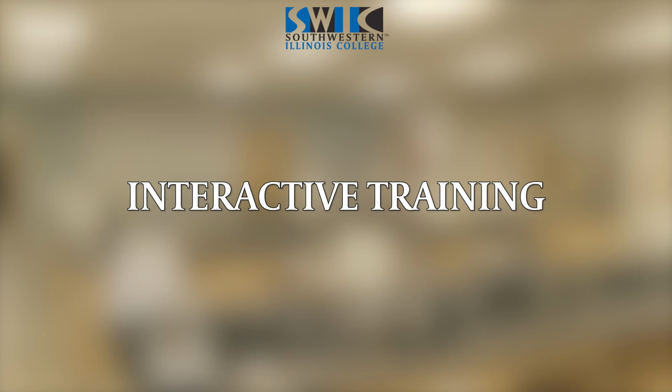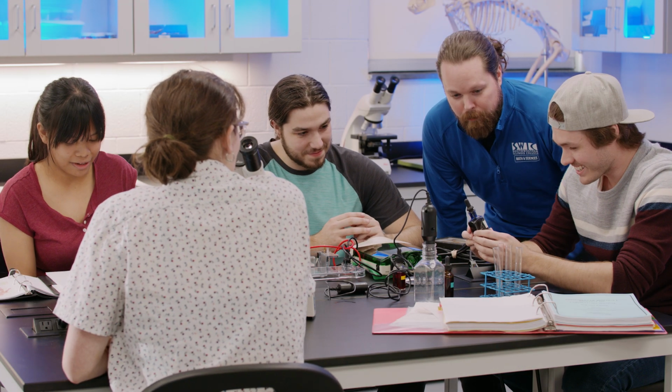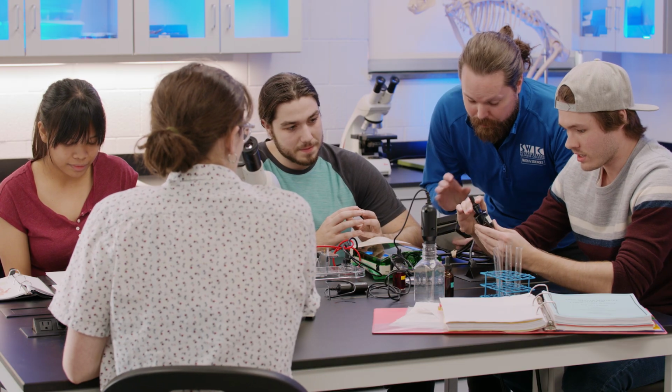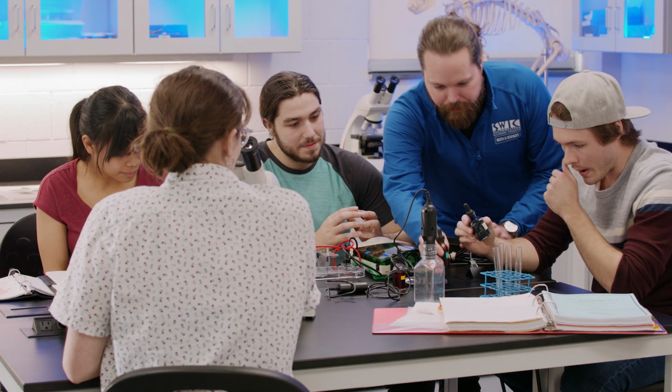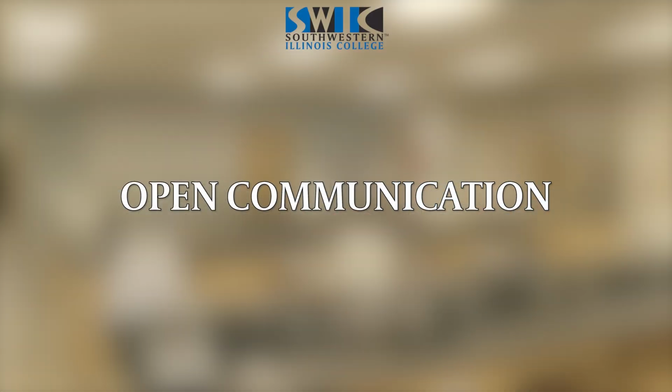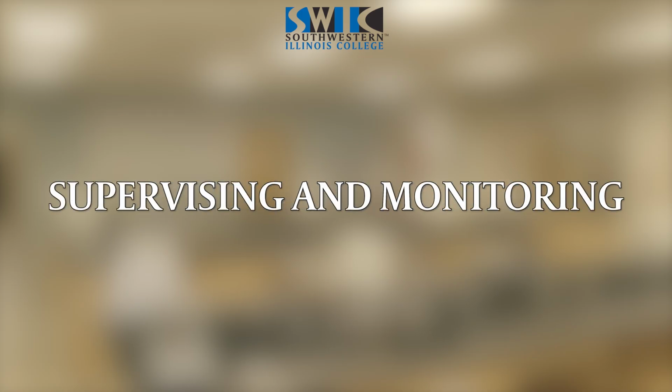Engage your students with interactive training. Conduct safety drills and hands-on activities to reinforce safety practices. Make sure they're comfortable with lab equipment and techniques. Encourage open communication. Let your students know that they can approach you with questions, concerns, or reports of unsafe conditions. As an instructor, you are the leader in the lab. Your vigilance is essential to ensuring everyone's safety.